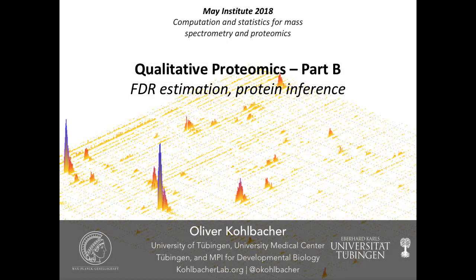Okay, then let's talk about FDRs and about protein inference. I know that some of you already moved into that going through the tutorials. I apologize for that, but it's very hard to have the talks exactly at the point when everyone needs them, and you all move at very different speeds. So occasionally we have to explain a few things after you already stumbled upon it in the tutorial.